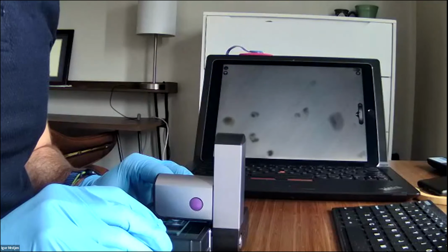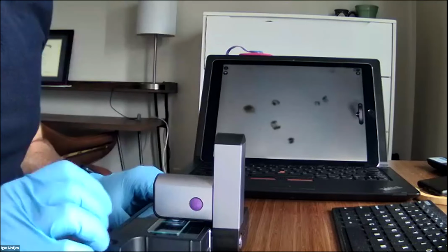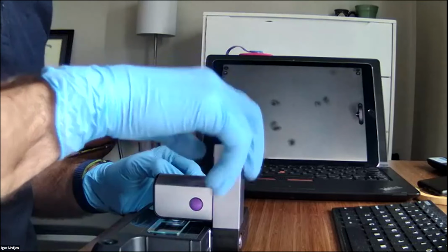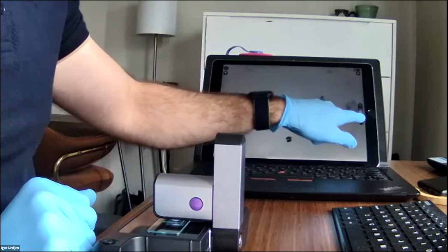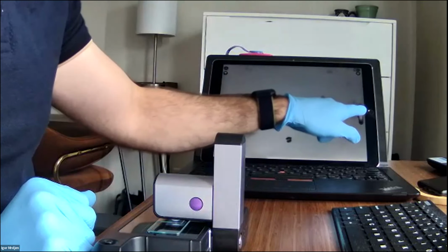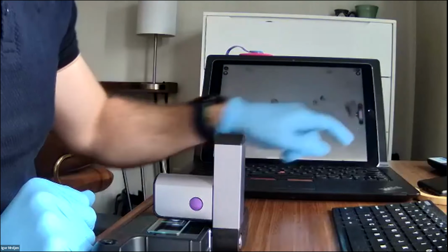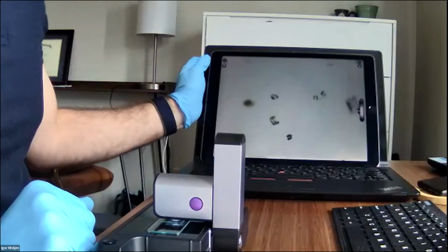And you can notice that some things may be a little bit out of focus on the level that I focused it on. And to get back into focus, you can easily just use that arm again, like right there, or there is the fine focus knob here on the corner that you can use to basically do fine focus adjustment and really zero in on the clarity for your stuff.